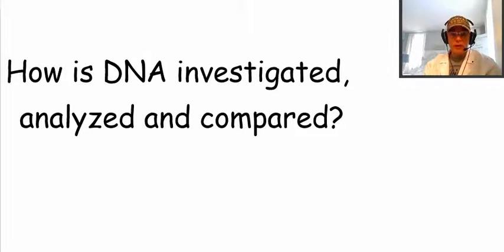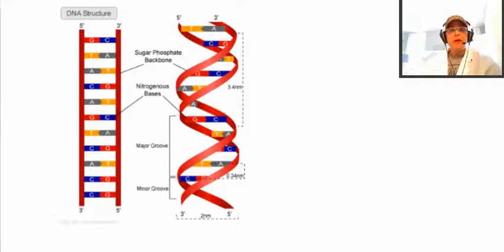Today we are going to look at DNA and how DNA is investigated, analyzed, and compared. Let's first go over the basics once again.